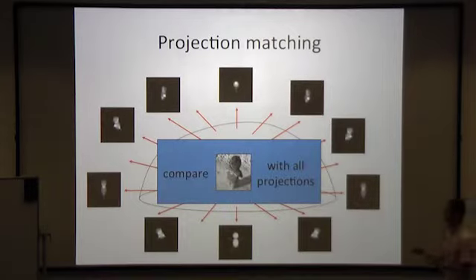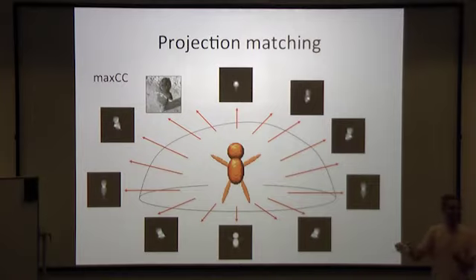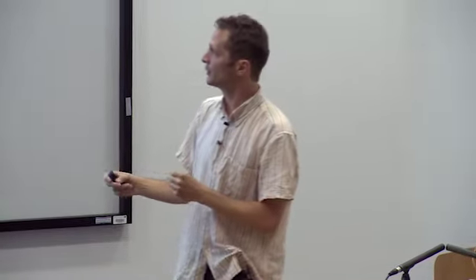And then we have all these experimental projections, and I've taken away the noise so you can see what's going on. And we're going to compare, and we'll come back to what that means, whichever of these reference projections fits best with the experimental image. And that could, for example, be a top view, but slightly from the side. Okay? Now, because we have many, many thousands of these projections in many different orientations, we can repeat this process for all of them. So now all two-dimensional images have been assigned an orientation relative to this three-dimensional reference object.